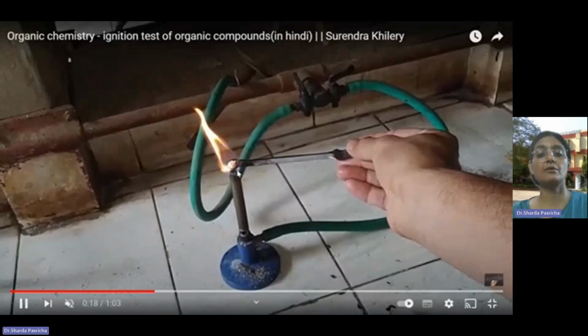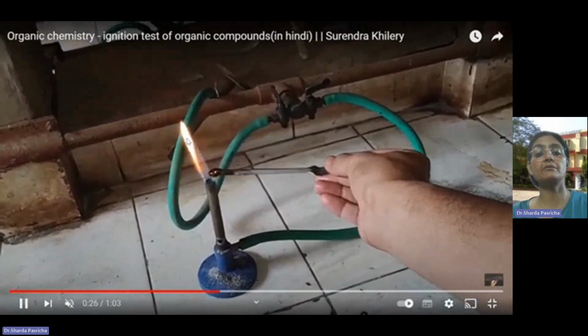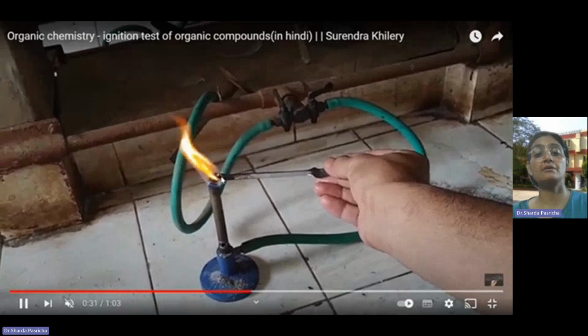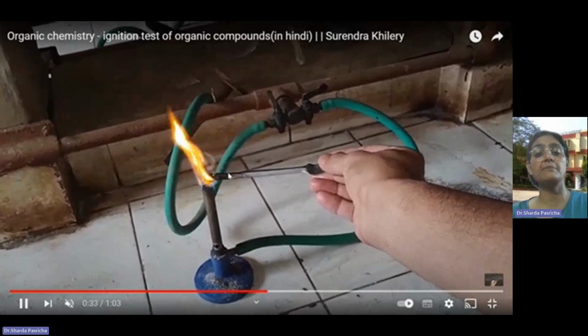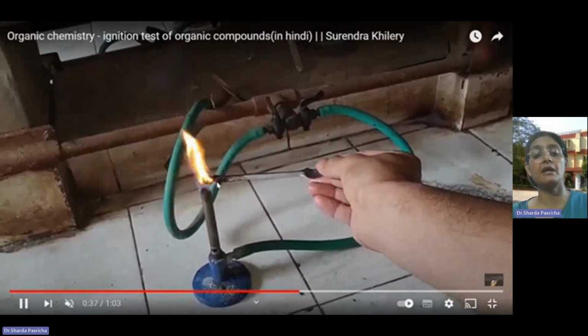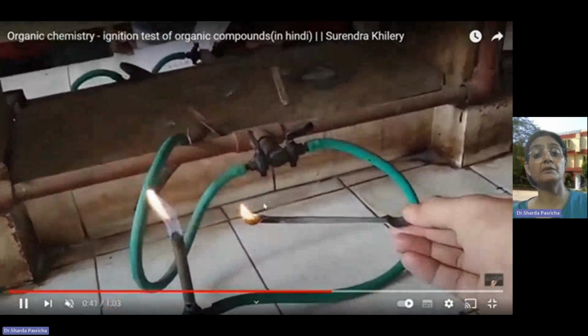Now you can see how the ignition test is being done. You have to take your compound in the metal spatula and start heating it. Instead of heating at the bottom of the flame, it is better to heat at the tip of the flame, which gives you maximum heat. Do not remove the metal spatula from the burner until you see the fumes coming and the compound has completely burned. Allow the compound to burn.